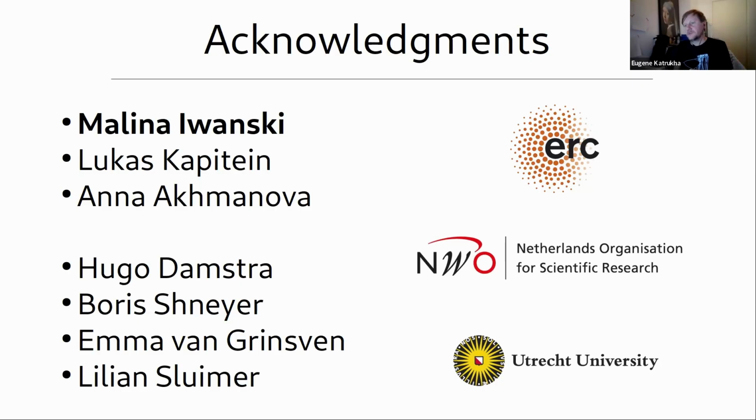So it really speeds things up, especially for newcomers, like master students, people who are not stuck with the old ways of doing things. So I don't see why Fiji and these plugins would be competitive. It's more that you can use these things complementarily, in parallel. Okay, thank you.